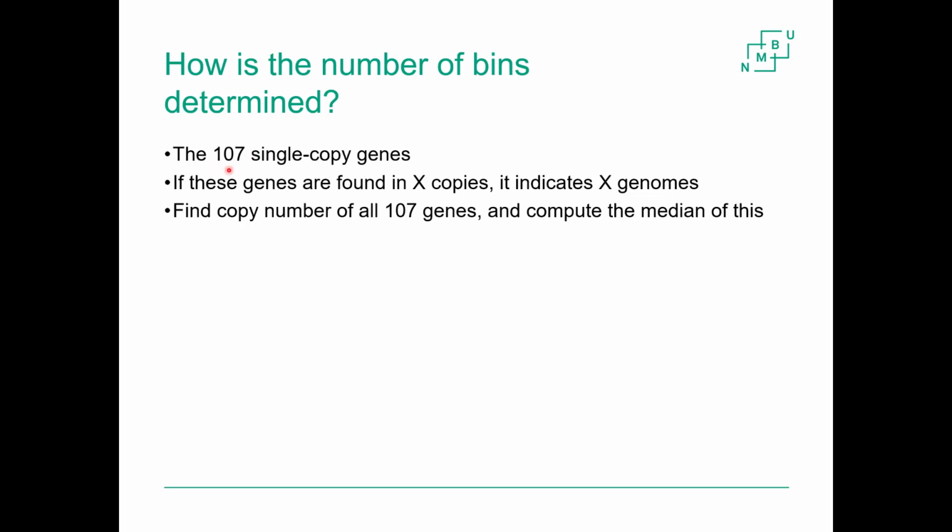And you should use the 107 as long as you have sampled a metagenome with a reasonable composition, meaning that the bacteria in there are probably the same bacteria we have in the databases, or at least something similar.